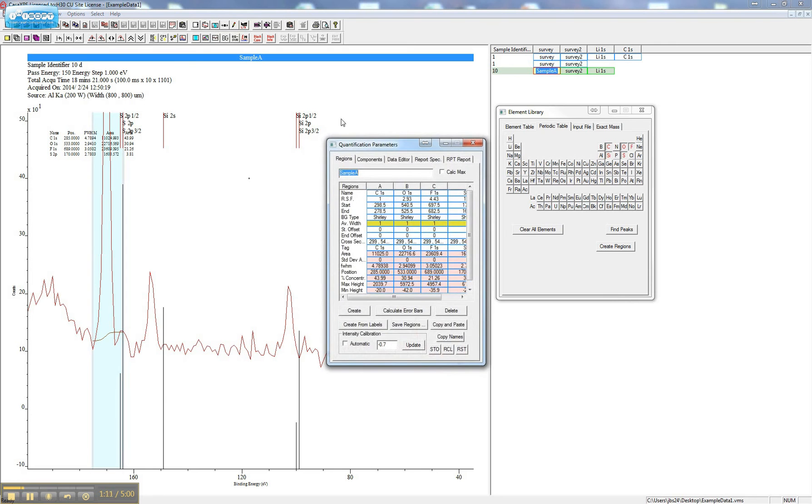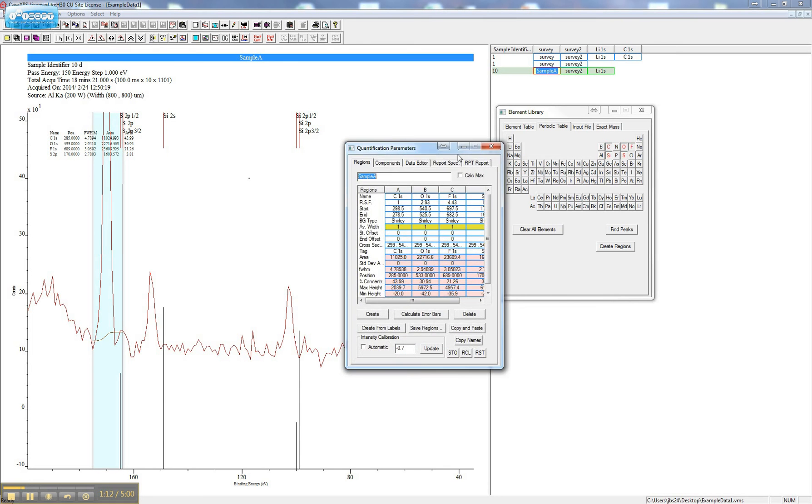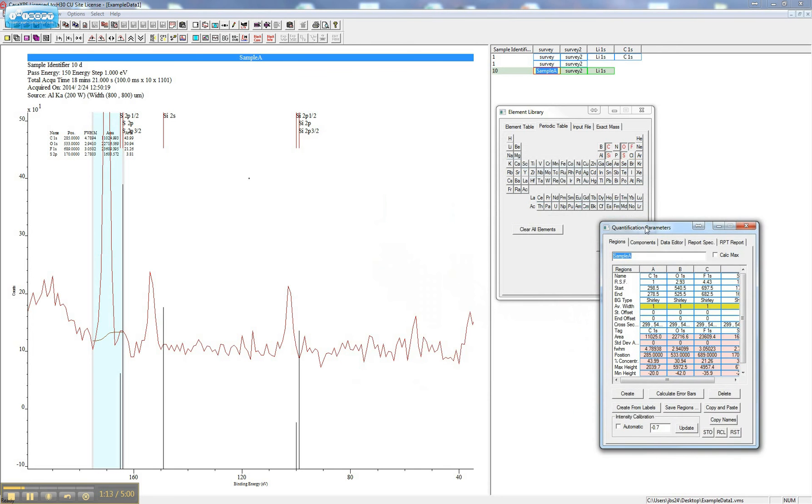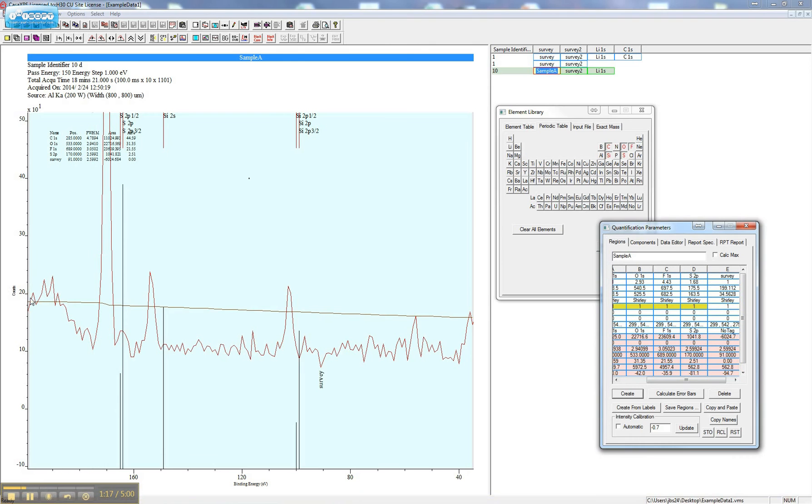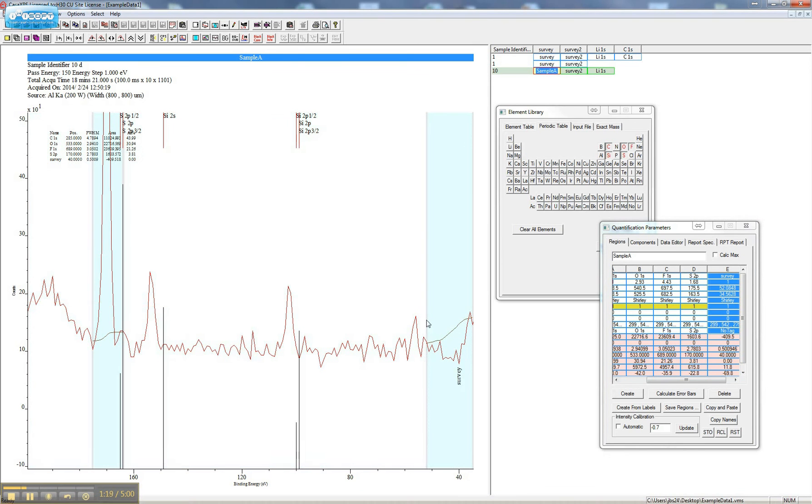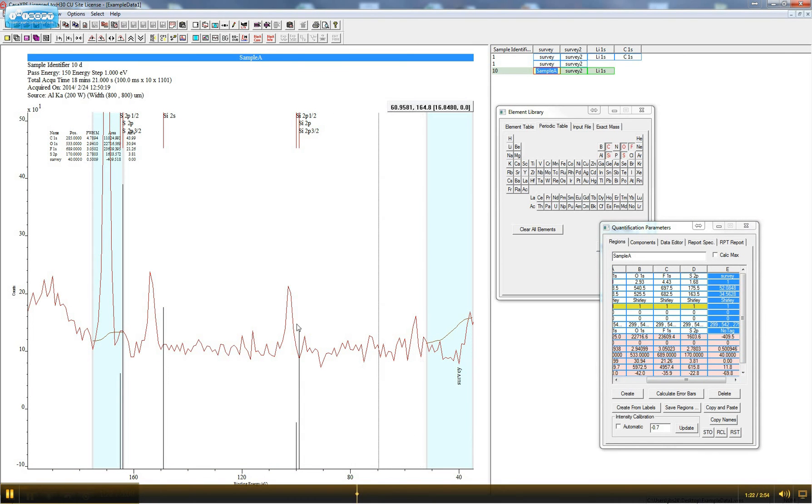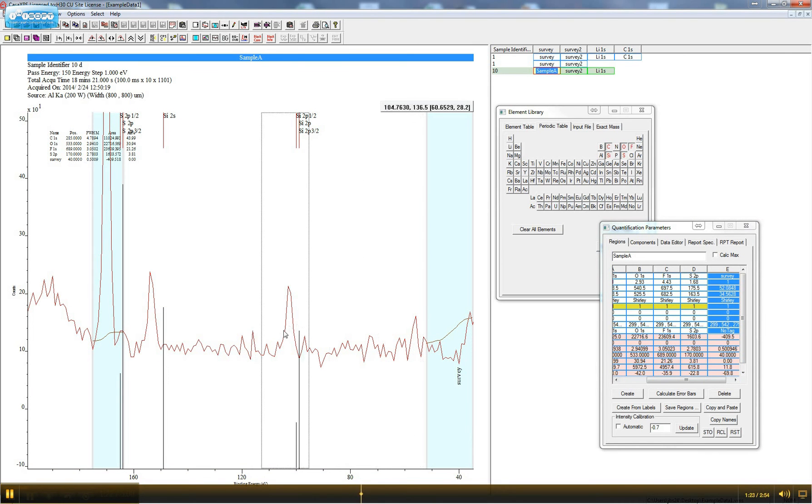Click the Quantify button. You're going to create a region, adjust the borders, so the background looks reasonable.